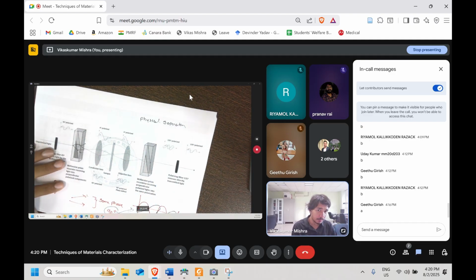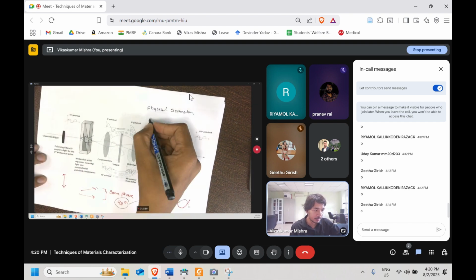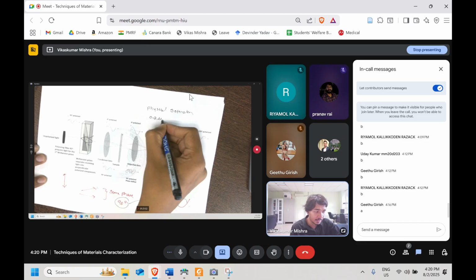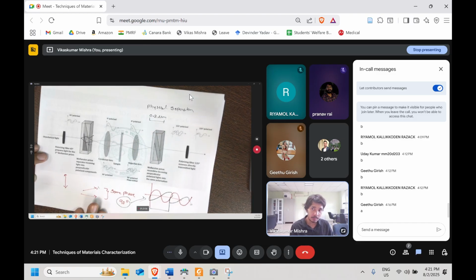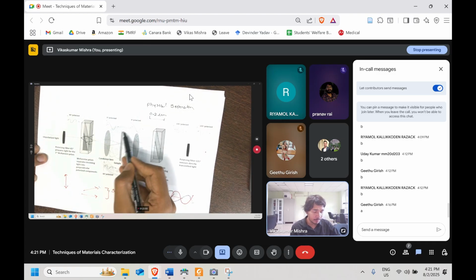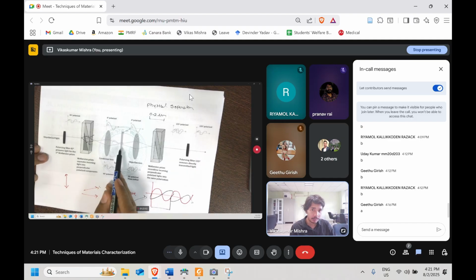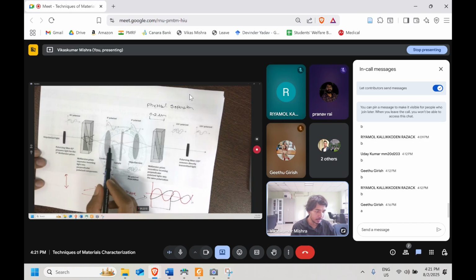This physical separation is very important. They will be separated by 0.2 micrometer. In the class we have seen why 0.2 micrometer is there, the difference. Now these two will get onto the specimen and now they are going to interact. With that, different thickness will give us different contrast. If some high difference is there, then also we will get the contrast over here.